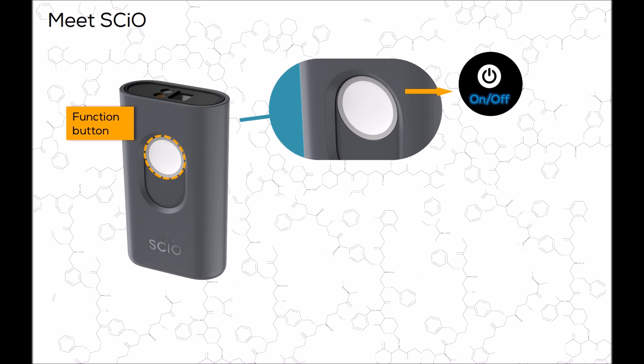Hold the function button for more than one second to turn SCiO on until it blinks blue, signaling you to sync your phone with SCiO. After syncing, when SCiO is ready to scan, the notification ring will turn solid blue. To turn SCiO off, press the function button for three seconds, and SCiO and the notification ring will turn off.